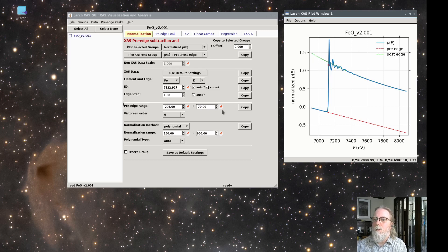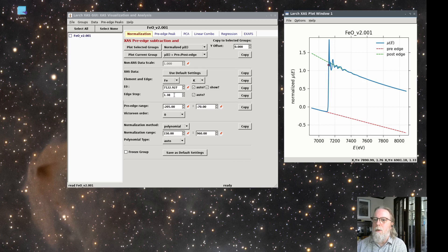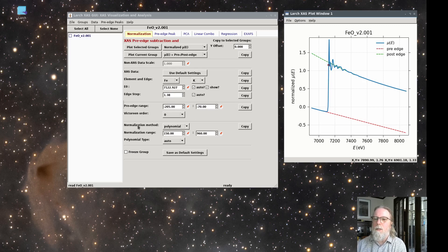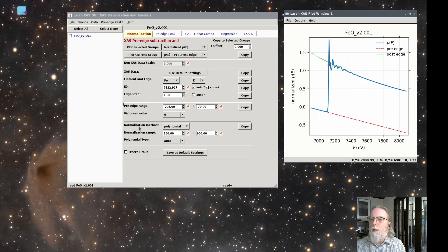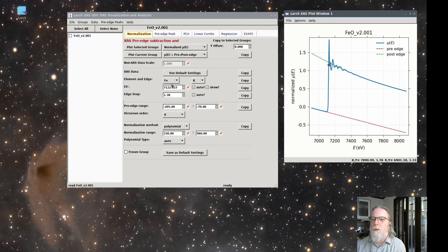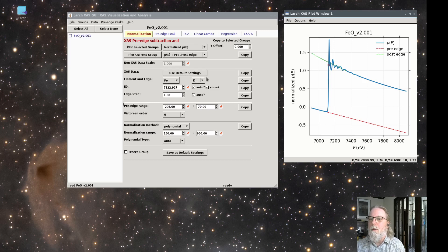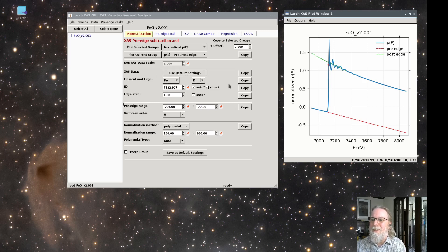Over on this form page, it'll show you that the edge step value it wants to use is 1.38. And it's showing you values for how it got the pre edge and the normalization curves. It also shows you the element that it determined it was iron K edge, which I'll get to in a bit as being important. So it's good to check that it's identified your data set correctly.